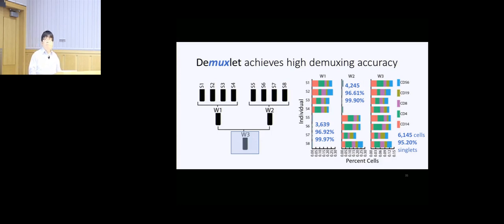So I believe that our method can be used, and actually we don't necessarily restrict our method to work only for RNA sequencing data. Any kind of sequencing data that is multiplexed by sample with a specific barcode tag, you can use it. So if you have that kind of data, you can use it.